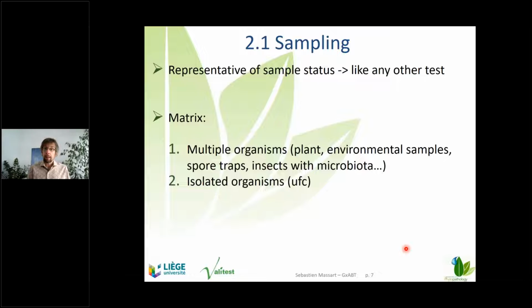You can start to apply high throughput sequencing from a spore trap or from an insect trap, and those are applications that are currently being developed. You use a spore trap and apply high throughput sequencing to determine which fungi are present there. You can do the same with insects: large scale trapping of insects, and you just extract the DNA from the whole composition and sequence it.